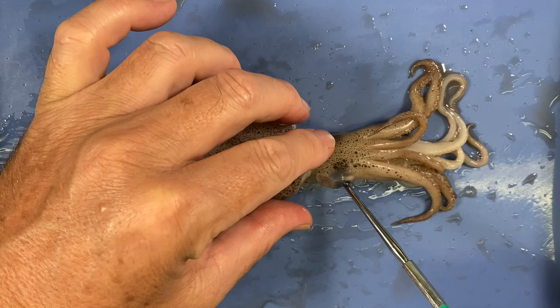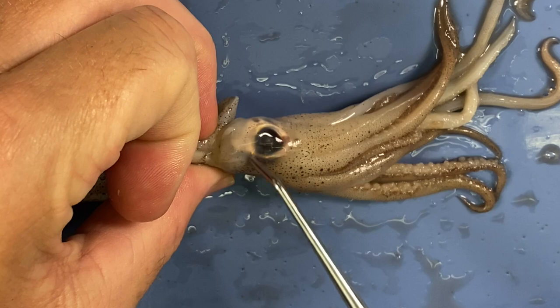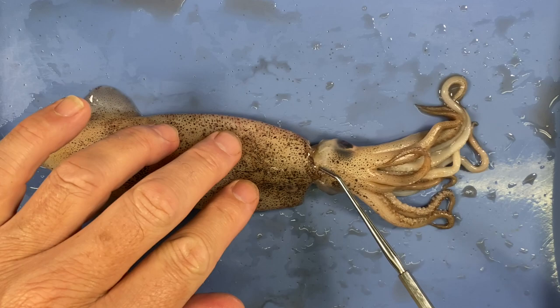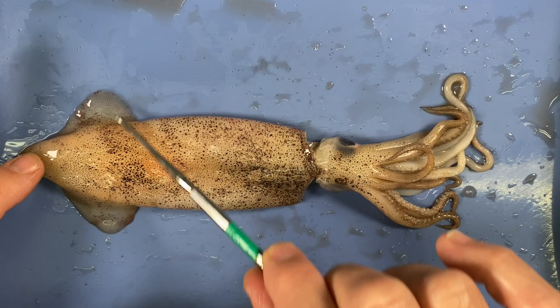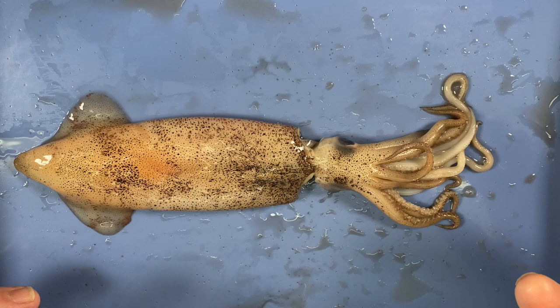We can look at the eyes in more detail in a moment, but relative to the size of the animal's body these eyes are huge, and it has very good vision. Some molluscs have a shell, some don't, some have lost the shell, and sometimes the shell is internal. A squid has a kind of internal shell — I'm going to show you that now.